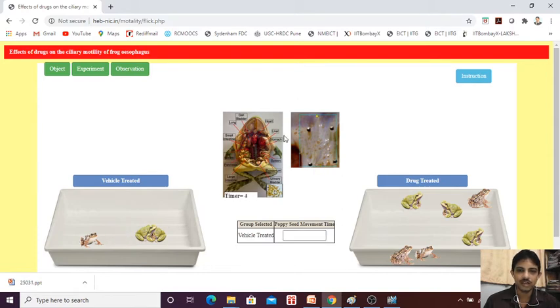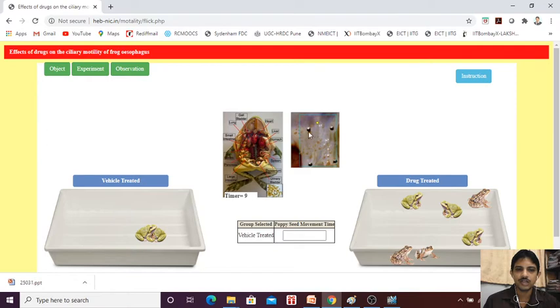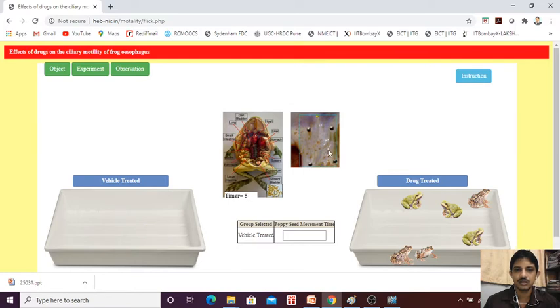Again, you can try another one — like here 33 seconds. In the case of the vehicle treated — vehicle treated means it is nothing but the saline treated — for every frog we need to check this. It is coming between 29 to 28, so we are going to note it down.